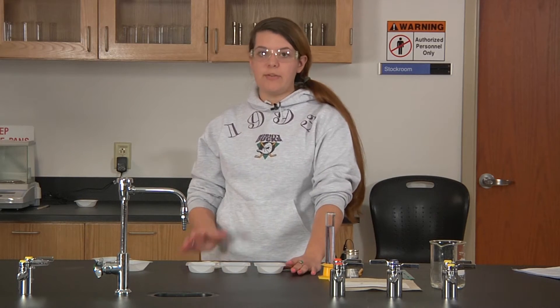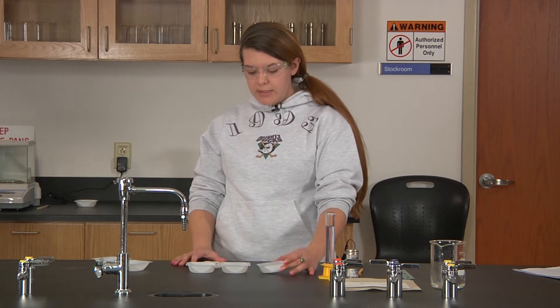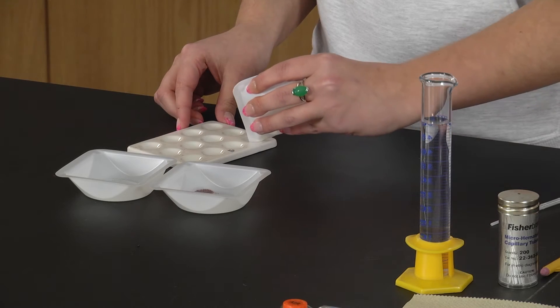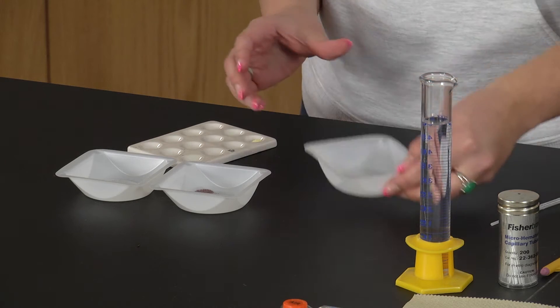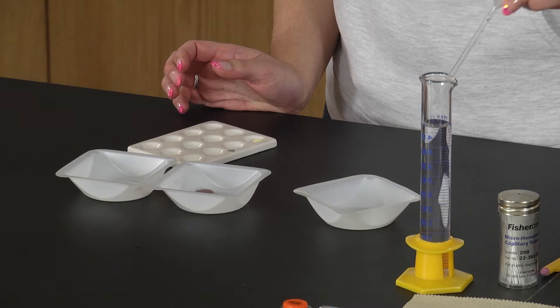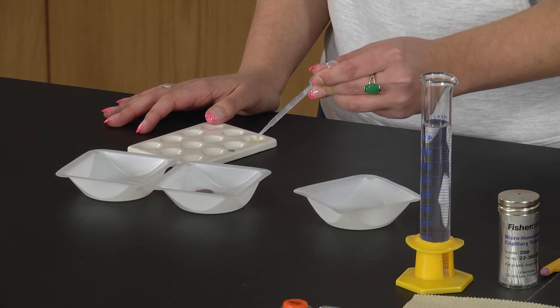Once you have all five of your samples weighed out, you're going to take each one and place the powder in a separate well in your well plate. Then add three drops of deionized water to each.